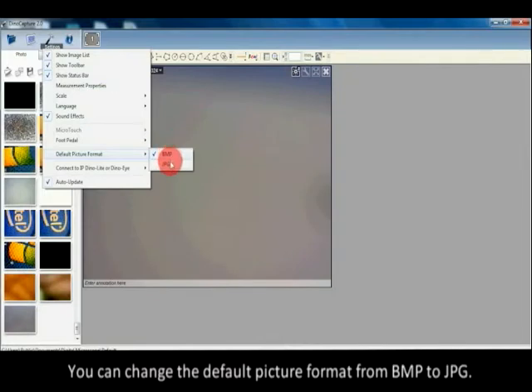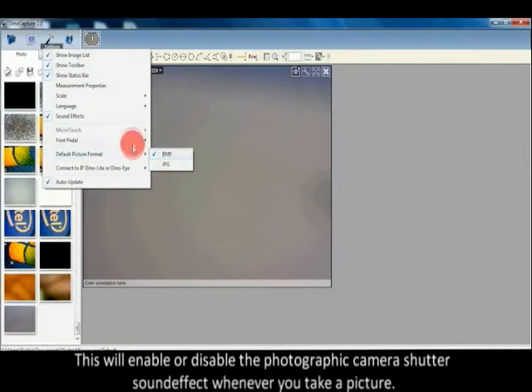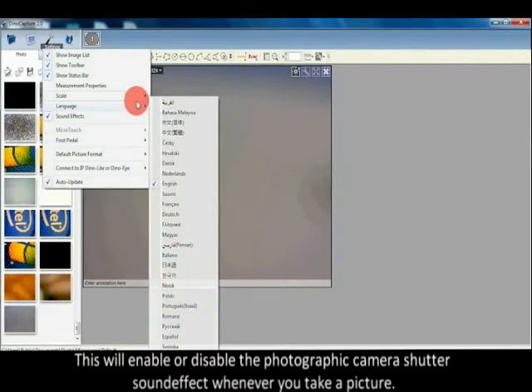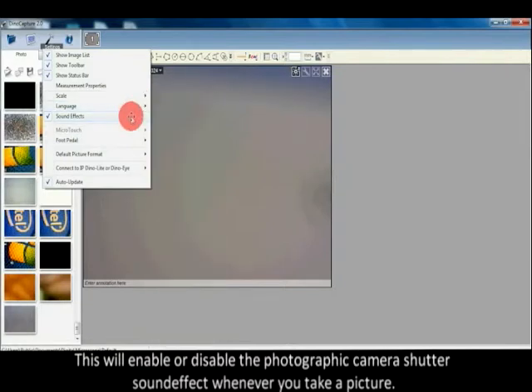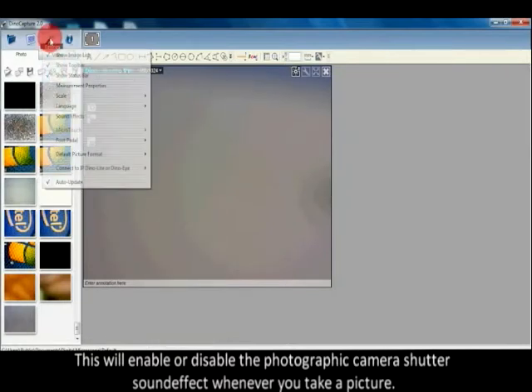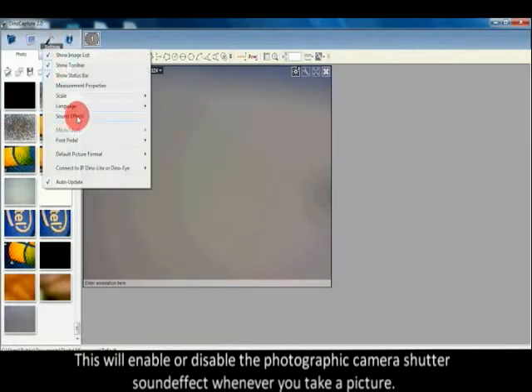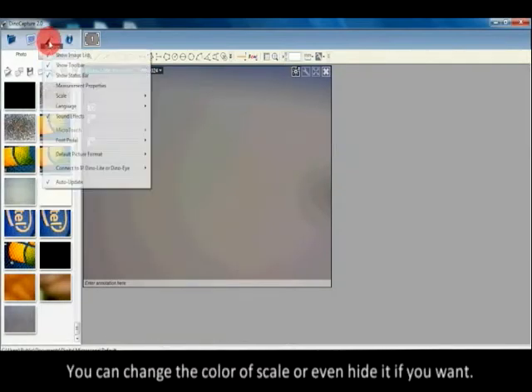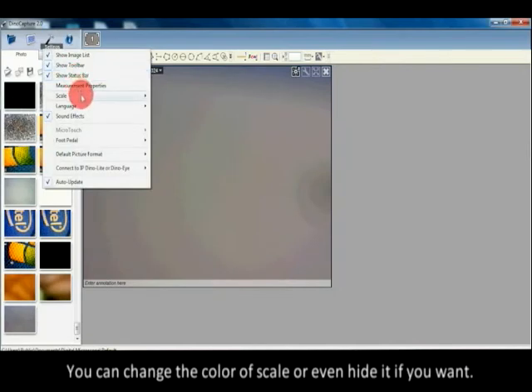You can change the default picture format from BMP to JPEG. This will enable or disable the photographic camera shutter sound effect whenever you take a picture. You can change the color of the scale or even hide it if you want.